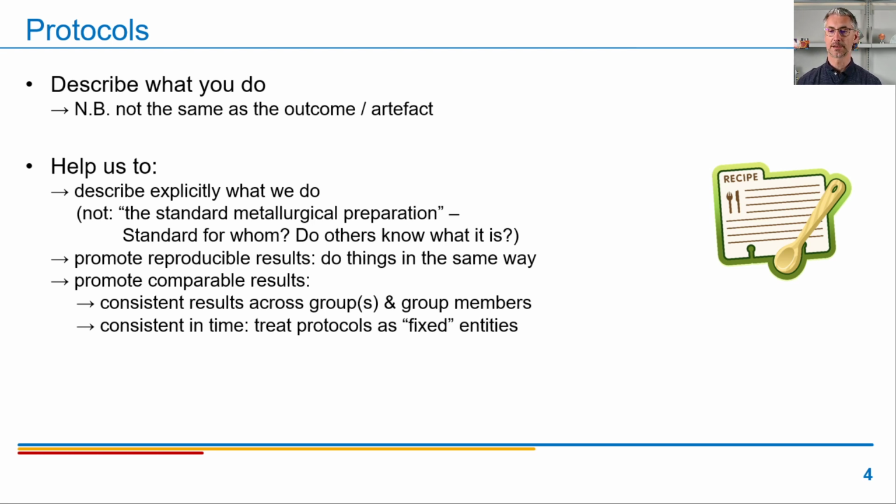This also allows us to promote reproducible results because we do repeat things in the same way, and it also promotes comparable results because we can achieve consistency across groups but also across time.